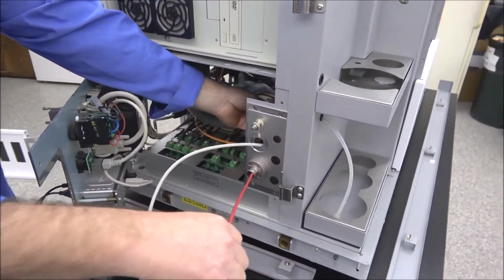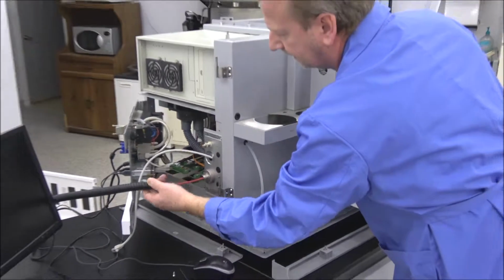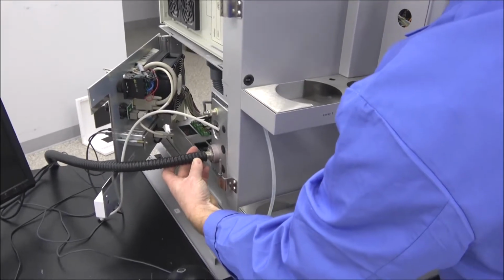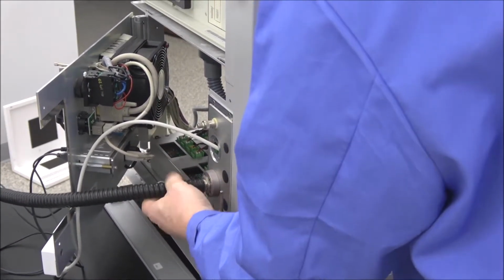And if you can see, I'm moving it up beside that camera up there. It's right on the back side of the camera. So I can walk around the front now, and I'm going to pull from up here, and we're reaching back, grabbing it, and I'm kind of feeding it in here like this. And now I want to attach this to this stem here. So I'm gonna turn it backwards a couple turns just so I can screw it on there.